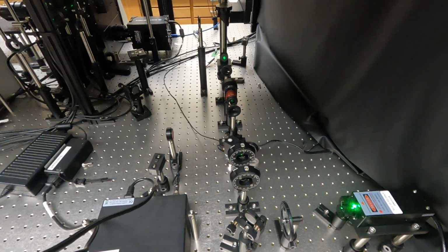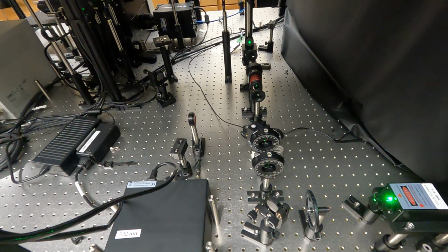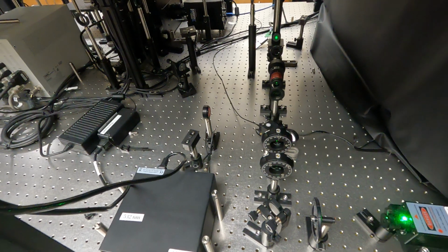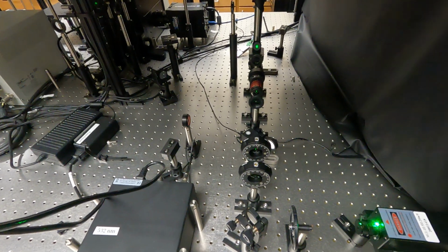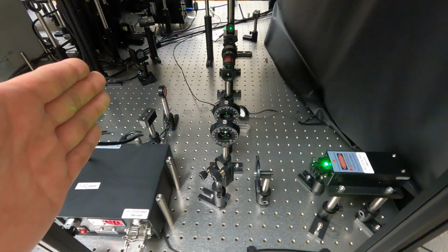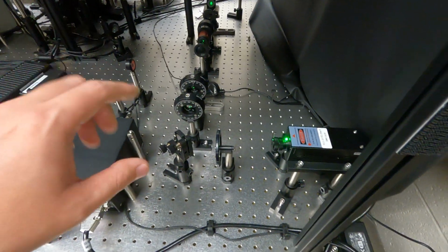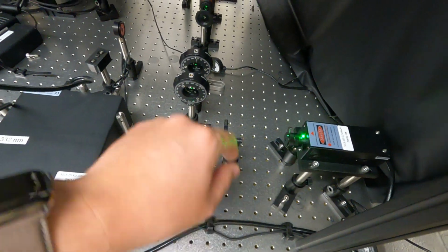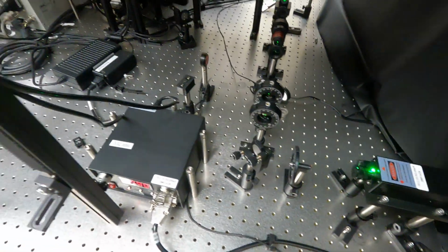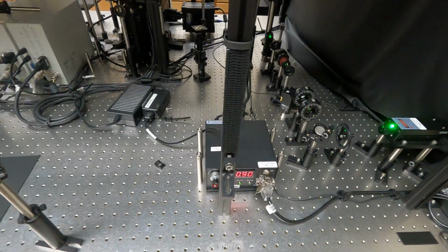Accidentally bumping any of the optics will lead to the misalignment of the entire setup, and then this instrument will be under service. We'll have to adjust them back so that we can continue our operation. So handle those optics with extreme care. Again, the only optics we'll be touching when we turn on the laser would be this wheel and also this flipping mirror. Nothing else. That's all we're going to be touching.